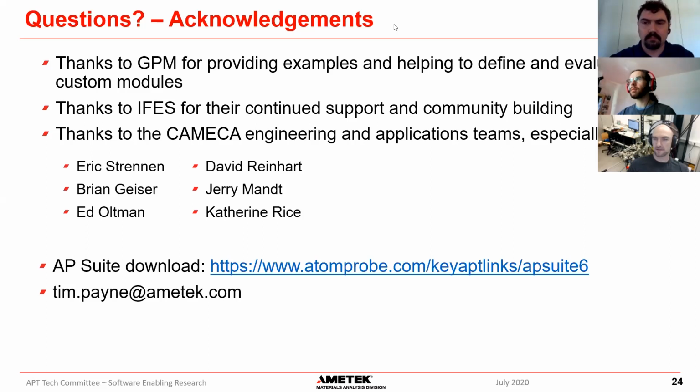Thanks very much. I just have a quick question myself. In terms of interchange between different labs, currently people are mostly passing around RHIT files between the labs that have Cameca-based instruments. How do you see interchange of data going forwards for lab users?